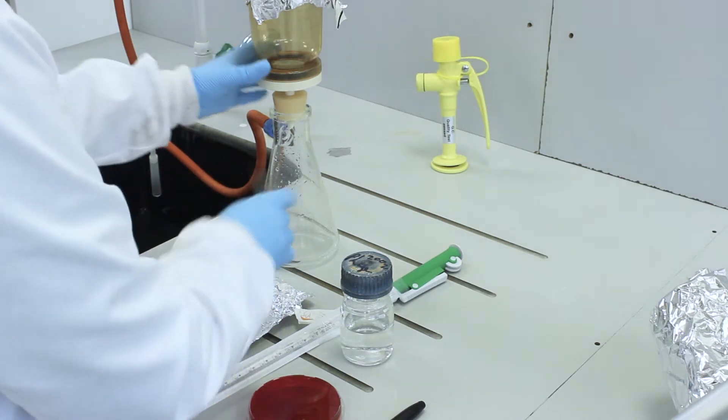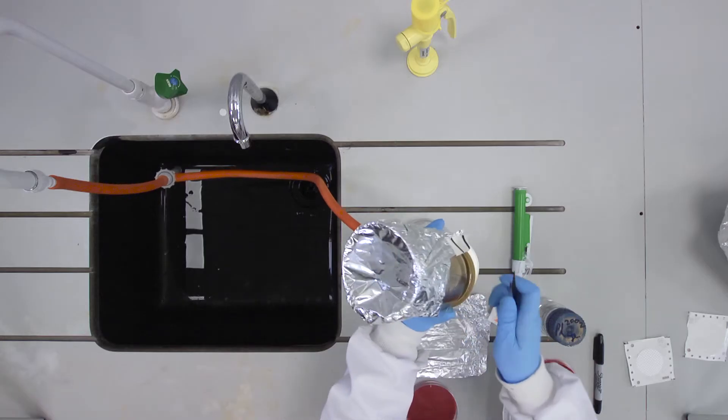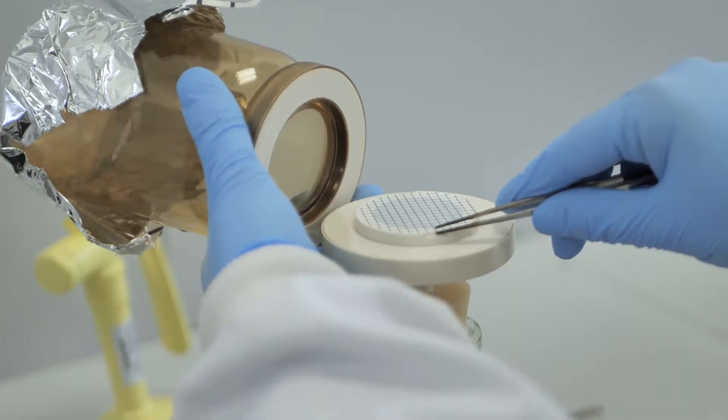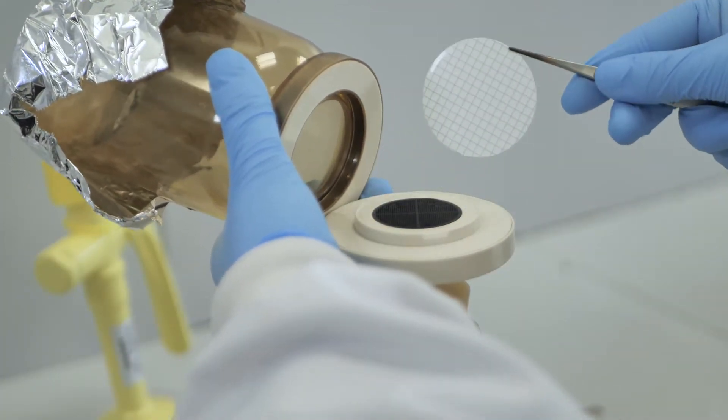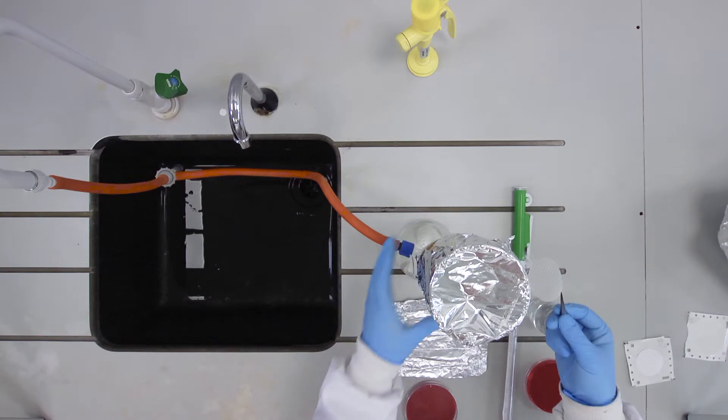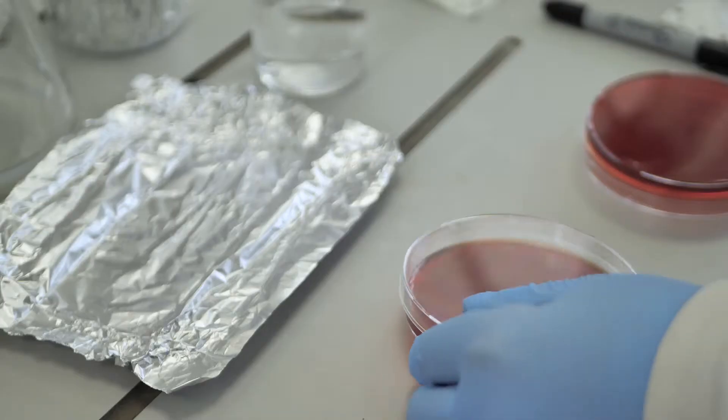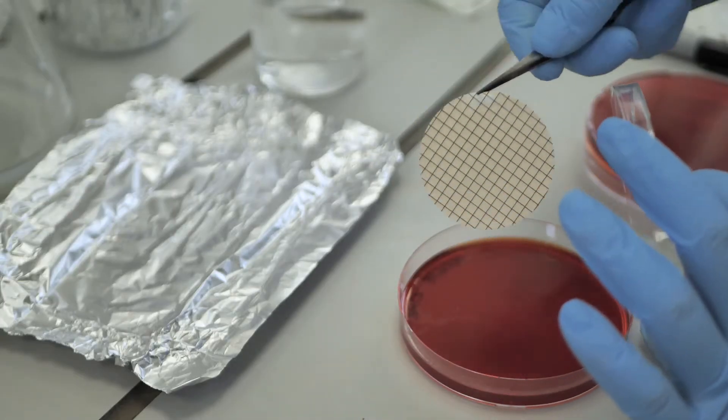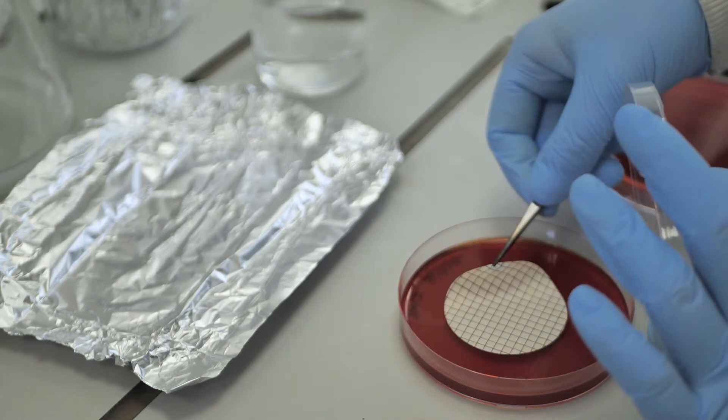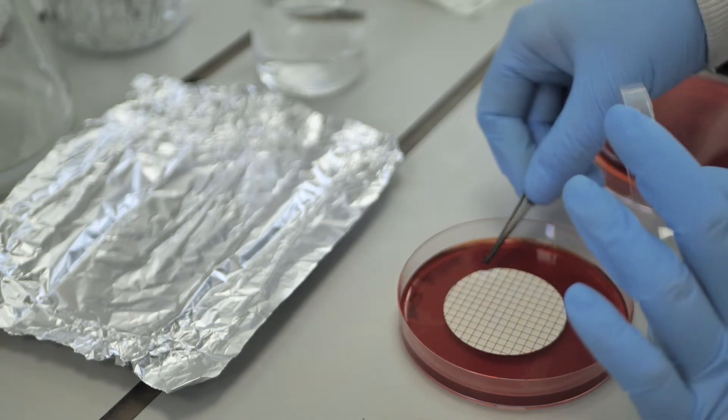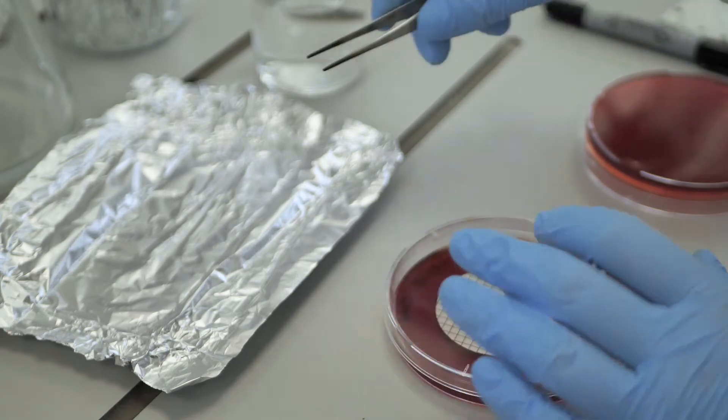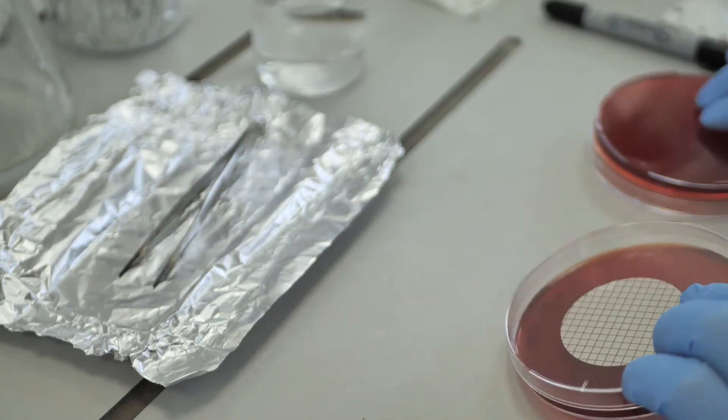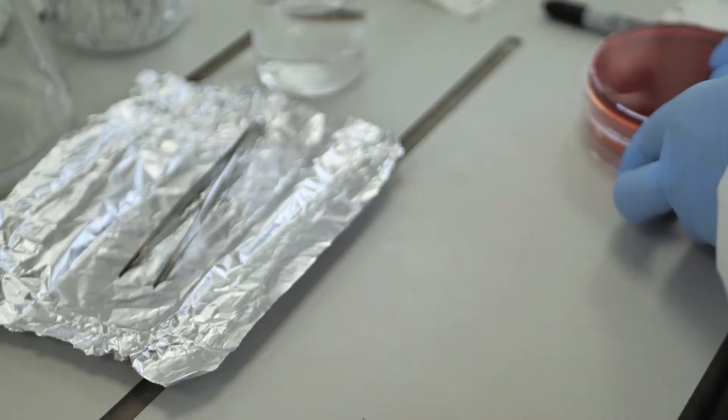Lift the funnel and using the groove in the rim of the base to gain purchase, remove the filter membrane with tweezers and transfer it to the surface of a membrane laurel sulfate agar plate, taking care to lay the filter flat on the surface of the agar.